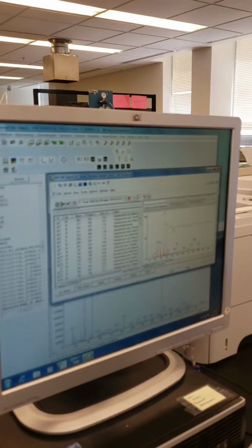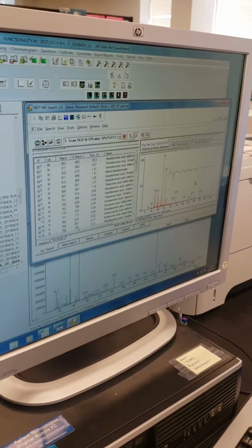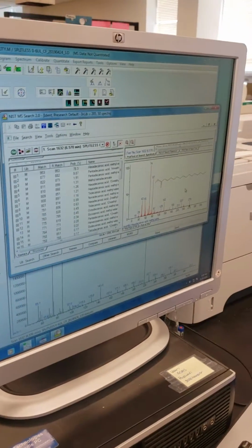Yeah. The melting point is very low. Could be, yeah. That's a good point. For the amount that we have there, we are trying to figure out which one is it, how the compounds are still in there. And we don't know.